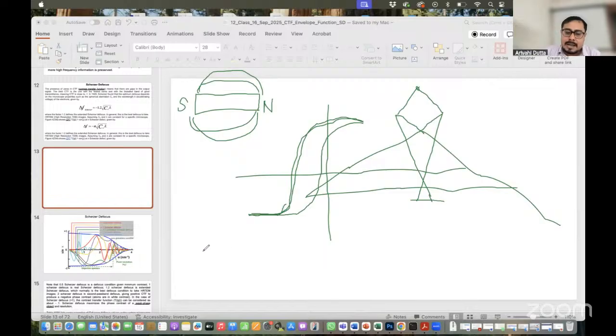If you recall, I told you that you have a hole size. So hole size, generally at 380x magnification, you have to check. Then you have to go to a little bit larger mag, that will be 4K mag. At 4K mag, you can see the hole properly, and in that hole where you want to image, just consider this box we are going to image.